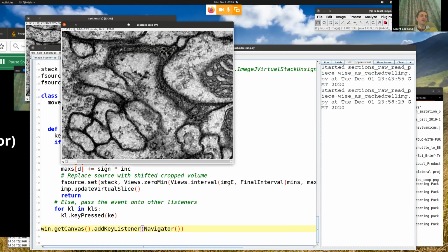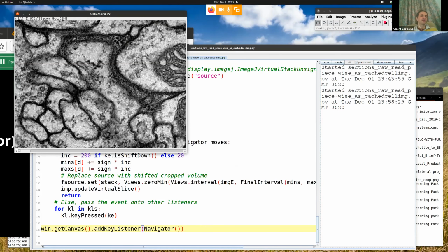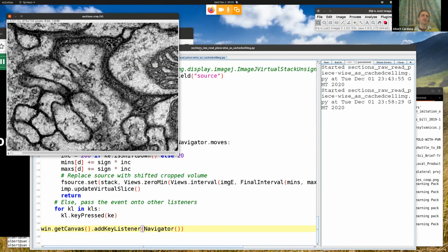And so here, if you now had some machine learning, you could say, okay, let's look at how the data acquisition is going. Is this data segmentable? Is it good enough, right? How would you do that? I think that's the last thing I want to do today, if the 18 remaining people are still with me.